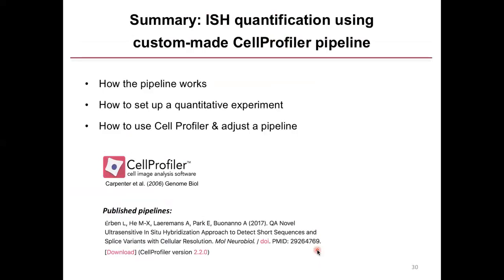I hope that the second part of the webinar has been useful to explain the use of our custom-made CellProfiler pipeline to quantify your in situ hybridization data. Please feel free to download and use our published CellProfiler pipeline. If you would like to revisit the example or questions to the quantification pipeline remain, please consult either our recent manuscript published in Molecular Neurobiology or our upcoming methods paper on this subject.